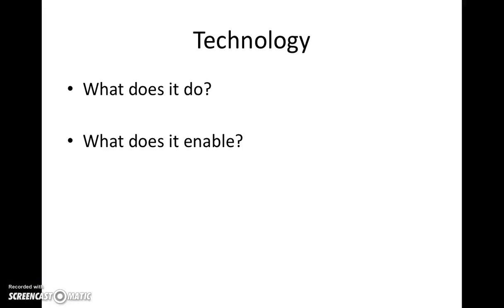If an educator takes the time to program in whatever resources they need, they will be available for the students using the program. Now, because this simulation is so very flexible, it's really scenario-based learning. So teachers can create their own labs, create their own procedure for what they want students to do, or their own almost like a physical resource, so their own set of chemicals and glassware and other materials available to the students, and then give the students direction either through email or in a class as to what they want them to do in this virtual lab. So it's really tailorable to whoever is designing the simulation and also to whoever is using the simulation, because you don't have to use all the resources that are available to you.